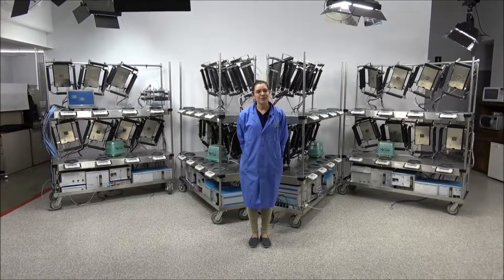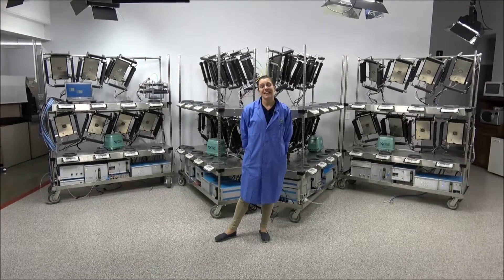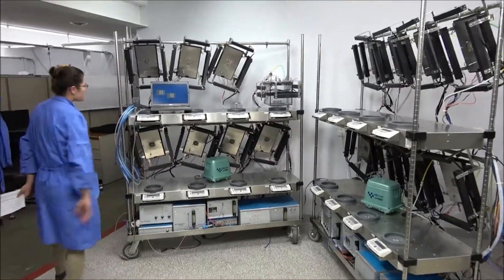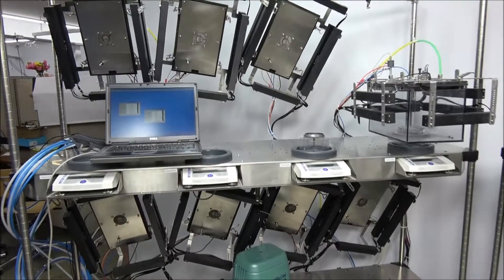Hello, my name is Jaina. We're here with New Life Scientific today and we're going to look at the Columbus Instruments CLAMS. CLAMS stands for Comprehensive Laboratory Animal Monitoring System. This happens to be an indirect calorimeter system that was originally set up for marmosets.